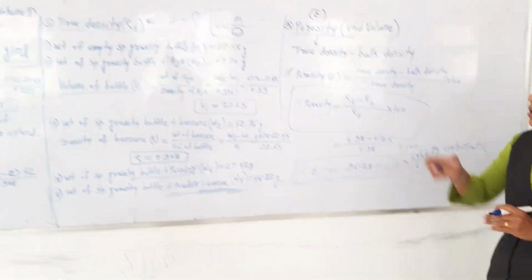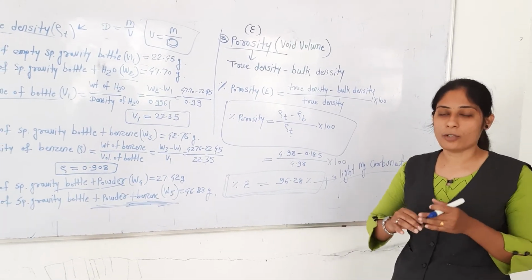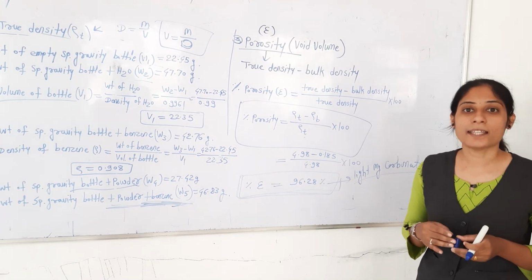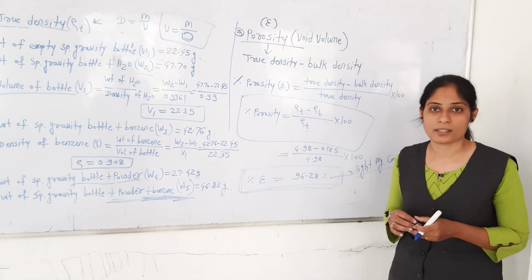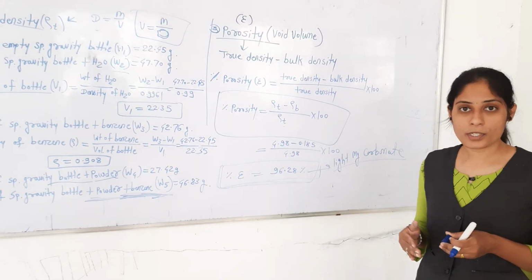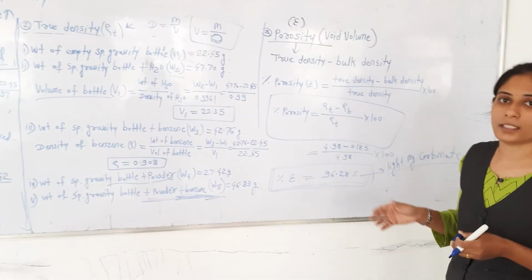And why is this determination required? Because we have to form tablet formulations and capsule formulations, and for that purpose we use powder samples. So mostly for determination of their voids or pores, we use the true density, bulk density and porosity.